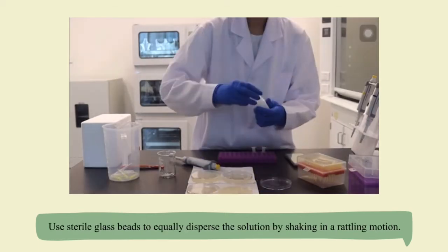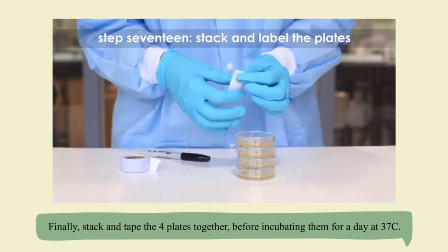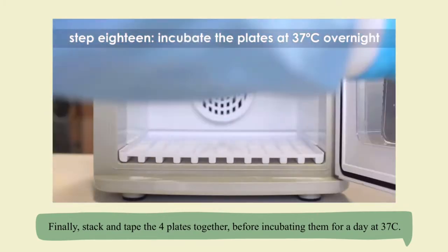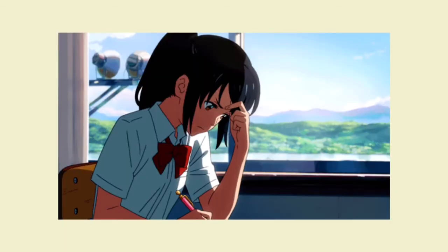Use sterile glass beads to equally disperse the solution by shaking in a rattling motion. Finally, stack and tape the 4 plates together before incubating them for a day at 37 degrees Celsius. In this segment, I would like to explain about the discussion portion of the lab.